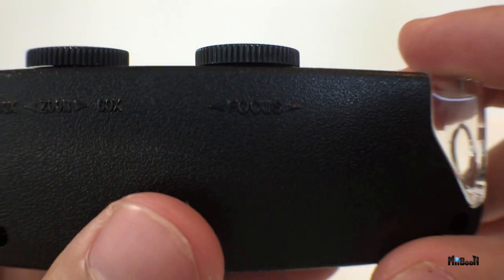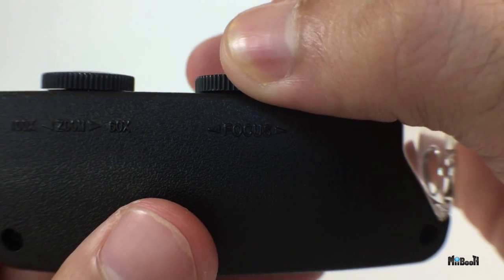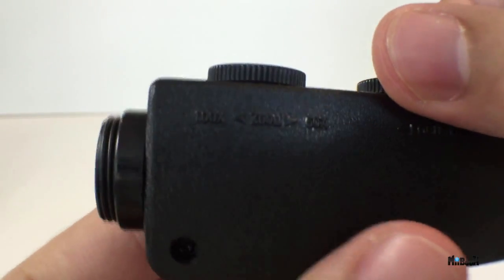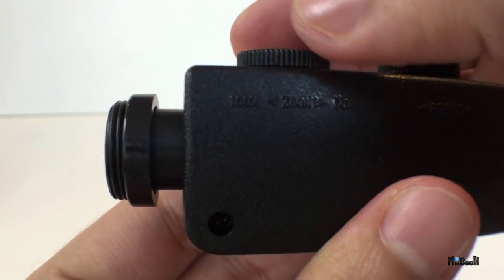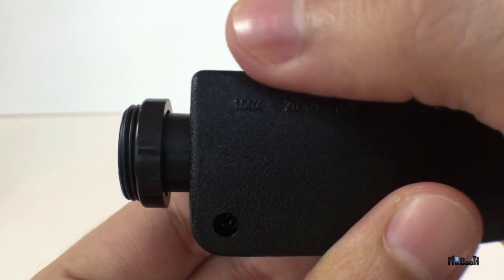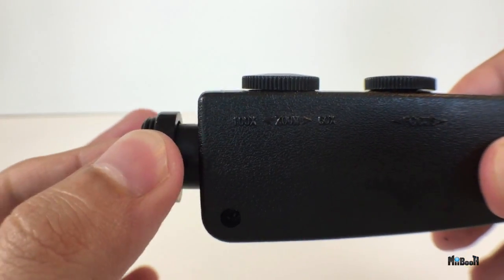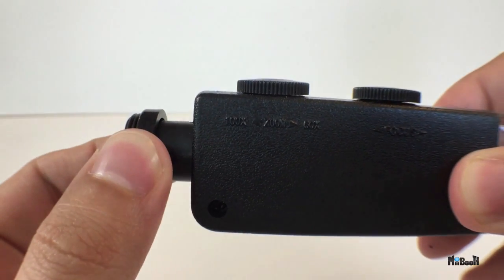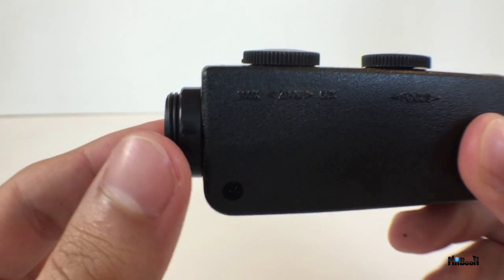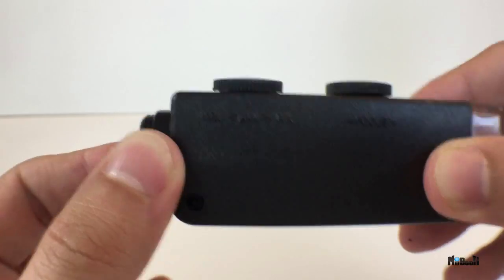On one side it has two knobs. This one is for focus and the second one is for zoom. It can be adjusted from 60x to 100x. As you can see, when I turn this knob, this part moves in and out. So basically, you can change the magnification by just pulling this whole thing down when it is attached to your phone. Although I have to say, this part is pretty loose and moves freely for about 2 mm.